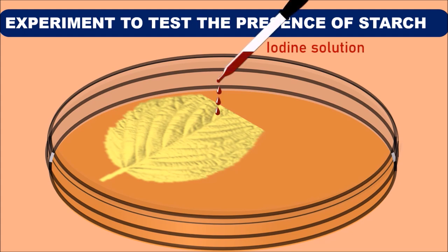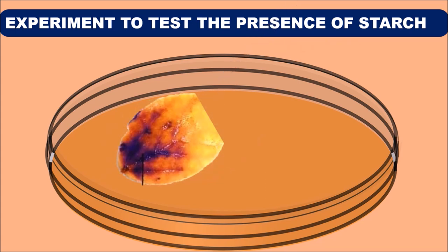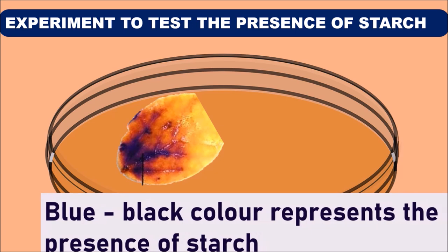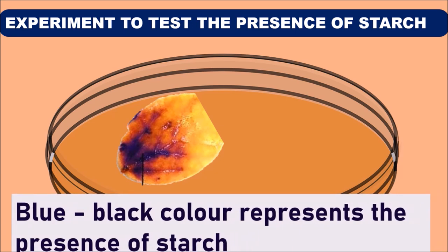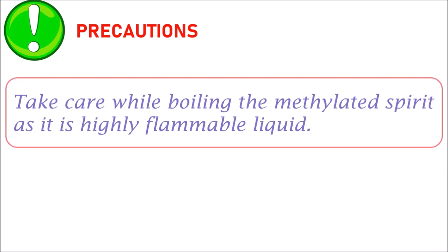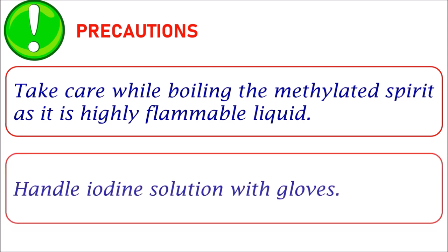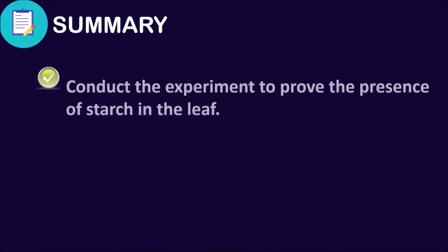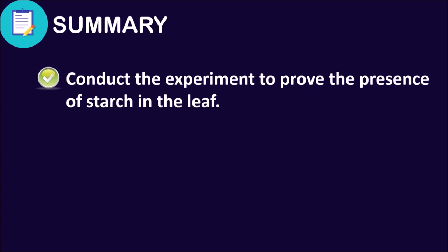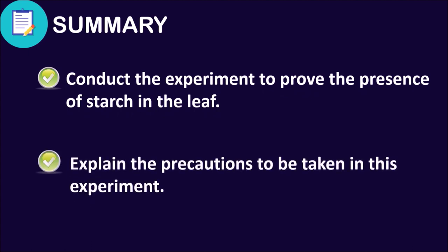You will be able to observe the blue-black color on the leaf. Blue-black color represents the presence of starch. Precautions: take care while boiling the methylated spirit as it is a highly flammable liquid; handle the iodine solution with gloves. Summary: this video has explained how to conduct the experiment to prove the presence of starch in the leaf, as well as the precautions to be taken.